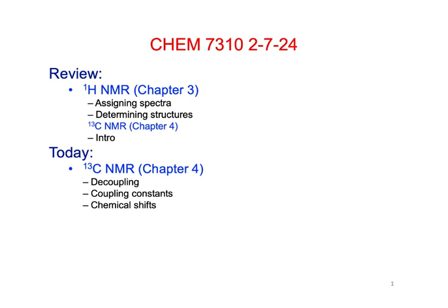All right, so we are still talking about C13 NMR. Last time all we did is kind of a short introduction. We talked a little bit about what is similar between C13 and proton NMR and what's different.